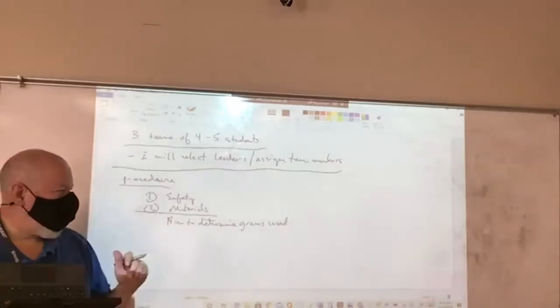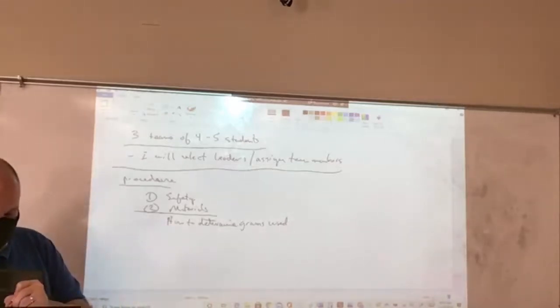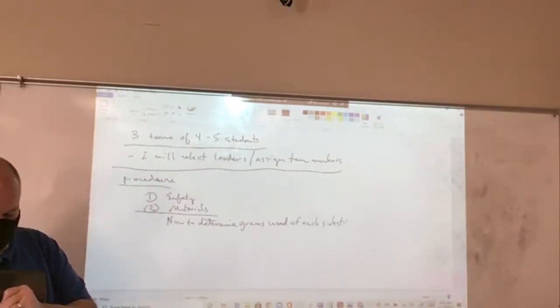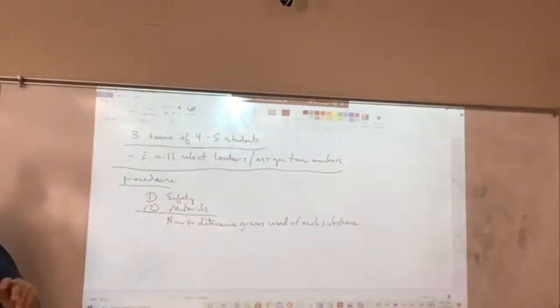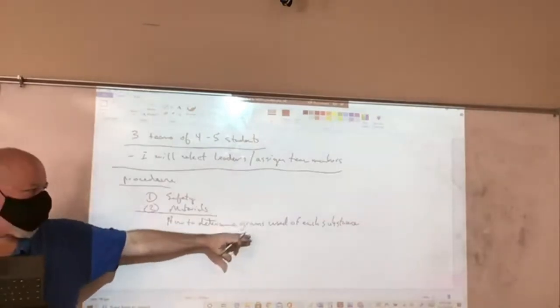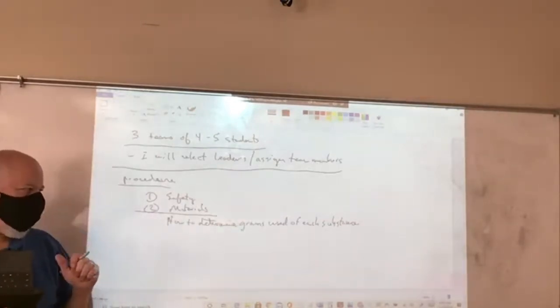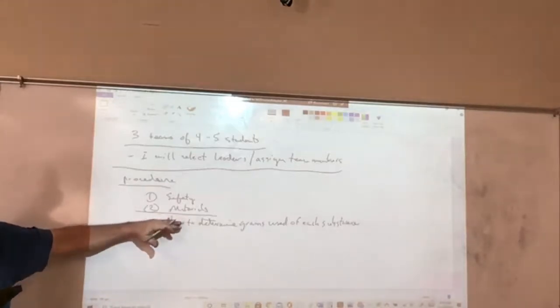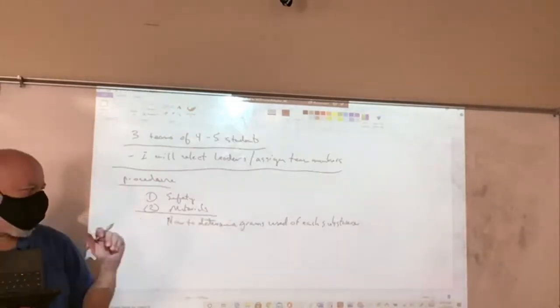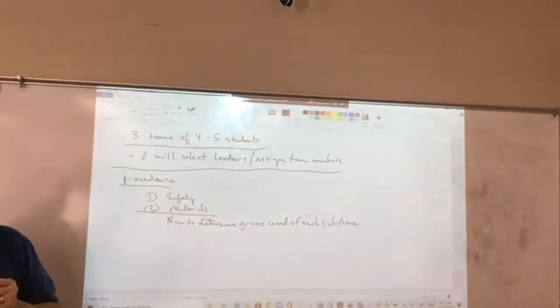How to determine grams used of each substance. Because you're going to tell your other divisions of your company how to do this, right? You want to communicate this to the rest of your company so they all know how to do it too. So I need, the first part of the procedure is going to be how to determine grams used of each substance. Okay, that'll take several steps.